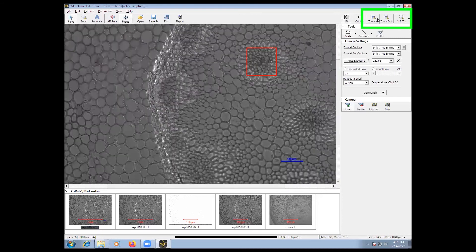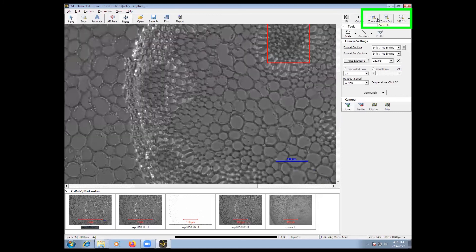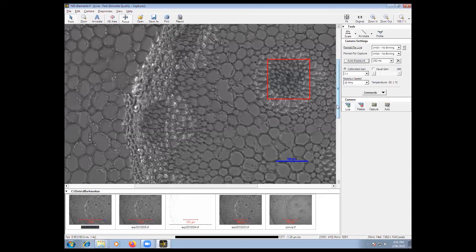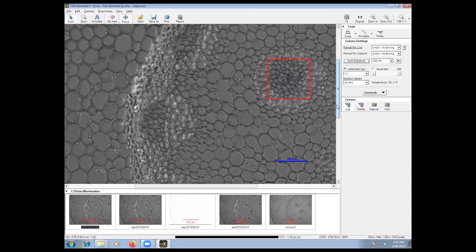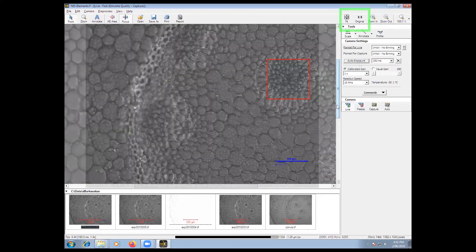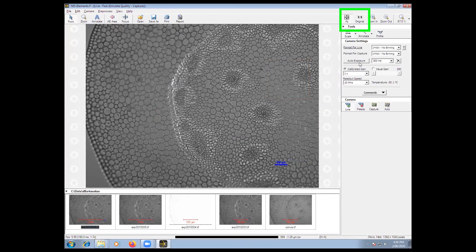On the top right, you can use the digital zoom, which is the magnifying glass, while you are focusing, which can be handy. And then you can return the image to the full screen by pressing this button.